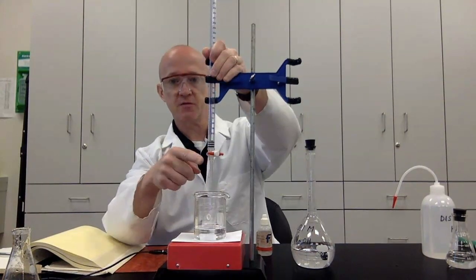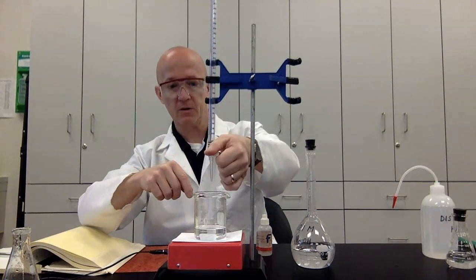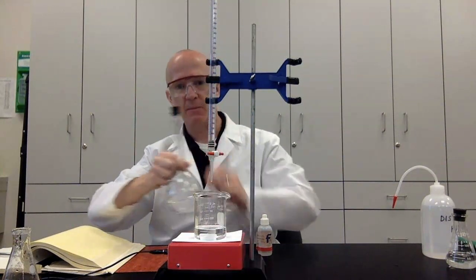I'm going to make sure that this valve is closed. It needs to be crossways and not this way, otherwise it's going to start pouring into my beaker. So I'm going to make sure it's closed, and using a funnel, I'm going to pour some NaOH into my burette.